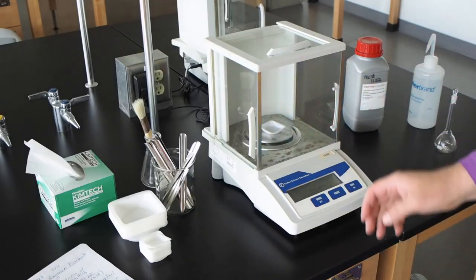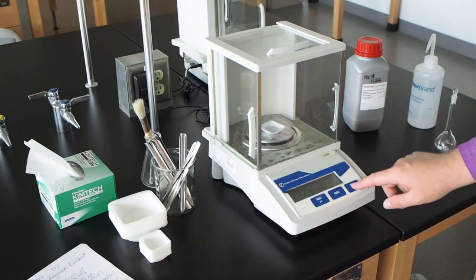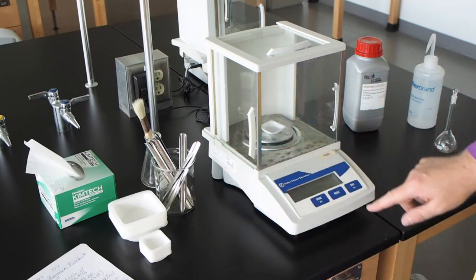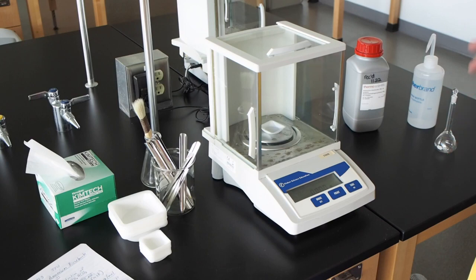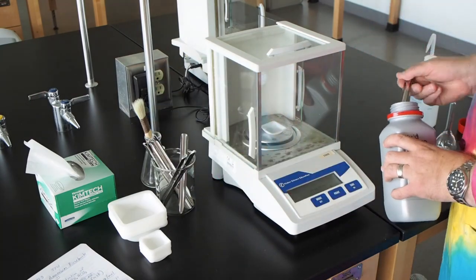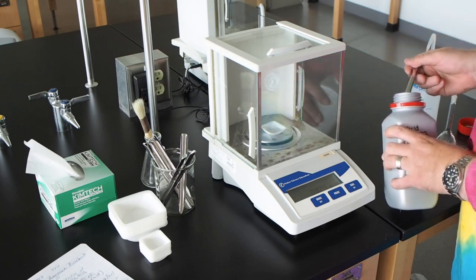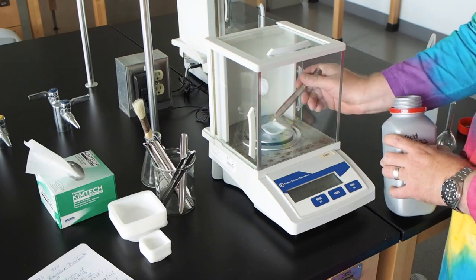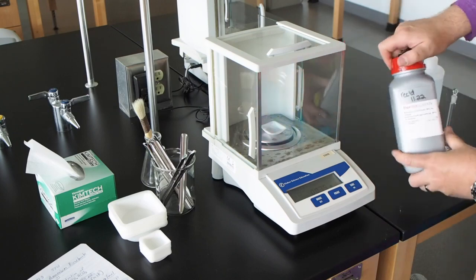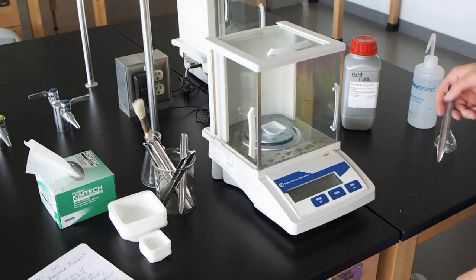So the first thing I need to do is grab a clean weighing boat, and I'm going to tare it. Notice the doors are closed while I'm taring. There we go. Now I've got this saying 0 grams, and I'll weigh it out. Because I know that this is a very small amount, I'm only putting in just a few crystals at a time now. I put the cap back on the bottle. I'm going to close the door here to take that reading.